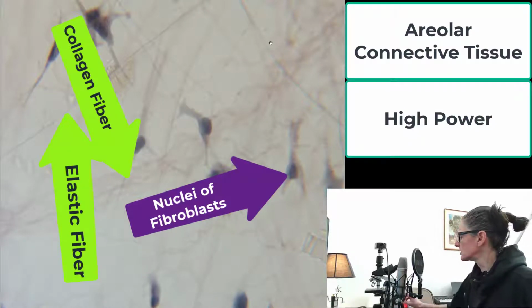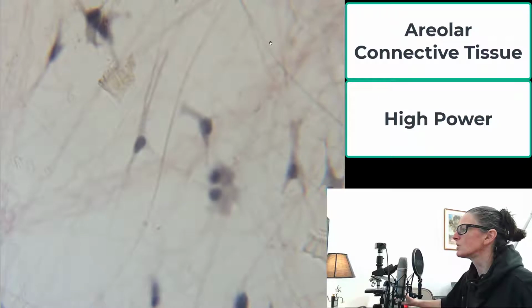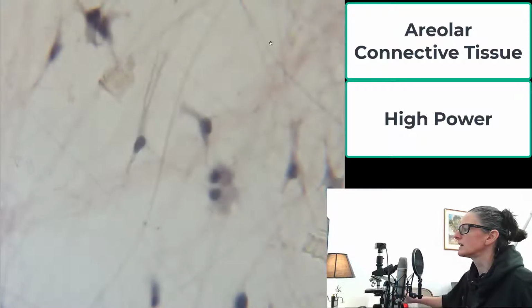And just to give you an idea of the depth of field, we can change the depth of field. We can bring some of our elastic fibers into view, into focus, and some of our nuclei come more into focus, and then we can change the depth of field again.